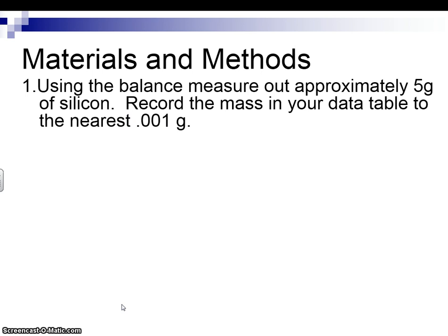You're going to take your samples back and measure the appropriate amount out using the scale. Remember, each of the 3 different samples have a required different amount of weight. And do not waste your time trying to get exactly 5 grams or 10 grams or 25 grams. Get somewhere in the ballpark of that and write down the actual amount to the nearest thousandth of a gram.